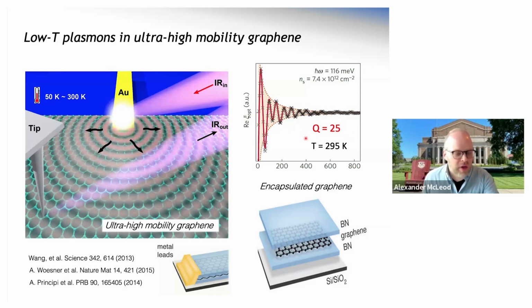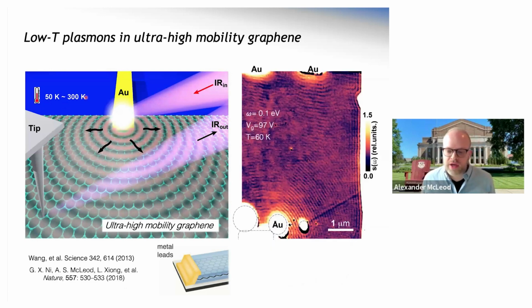So what we decided to do then is to see how far these plasmons can really propagate by using our sharp nanoprobe and imaging them, not just while tuning electrical currents or electrical voltages to the graphene, but instead tuning temperature. By cooling the graphene down, we can actually see the plasmons propagate for many, many tens of microns. And this is a consequence of the fact that the plasmon lifetime becomes very high. We can image that directly using the scanning probe technique at low temperatures.